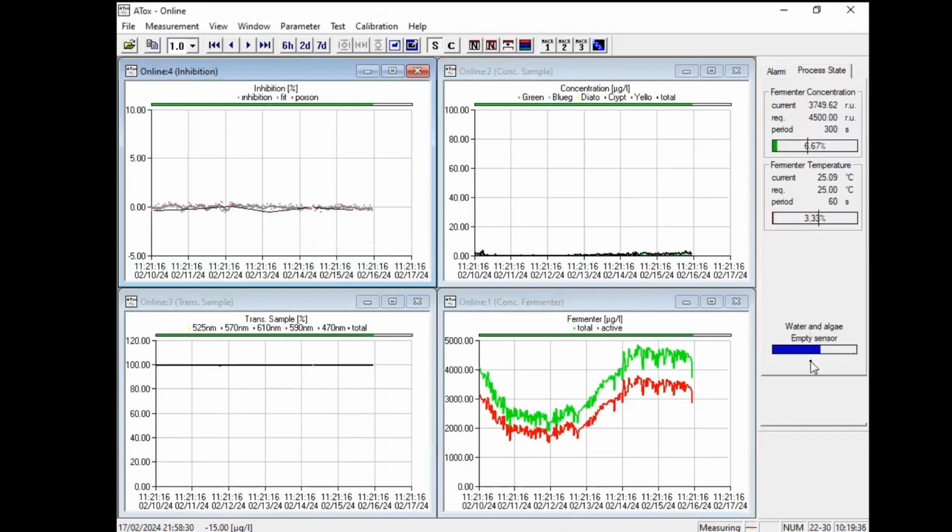So you see the progress of the measurement, and this blue bar will fill over time until one measurement cycle is finished. In normal configuration, it takes 30 minutes until the measurement cycle is finished, but there you can see the progress.